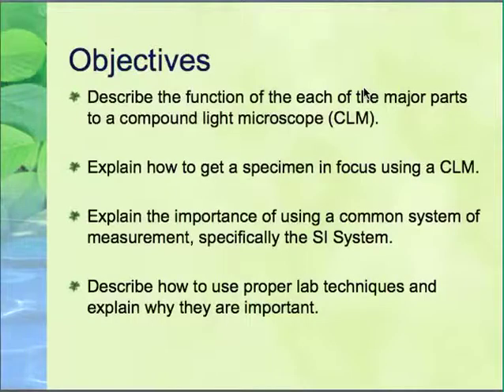I'm Mr. Doc, and today we're talking about tools of the trade in biology. That is to say, how to use a compound light microscope. More specifically, what are its parts and functions, how to use it, and why we'll be using it.